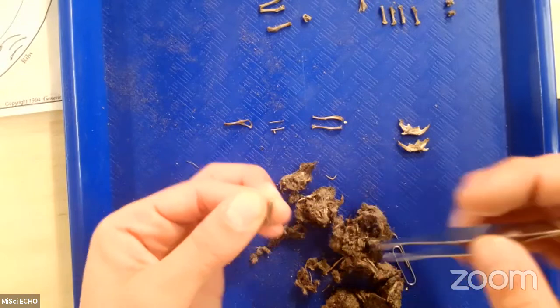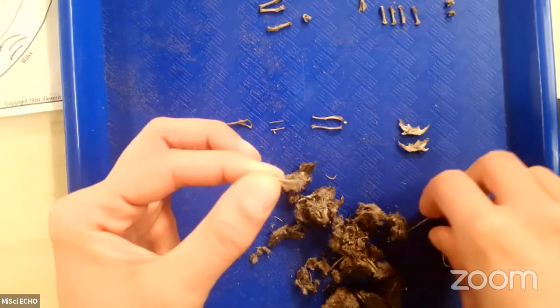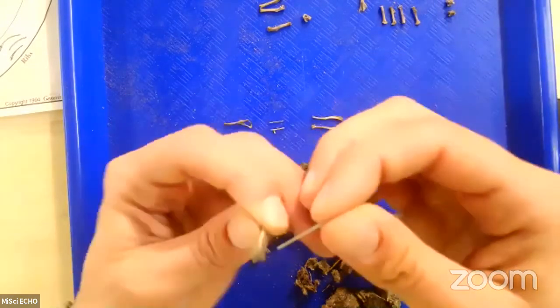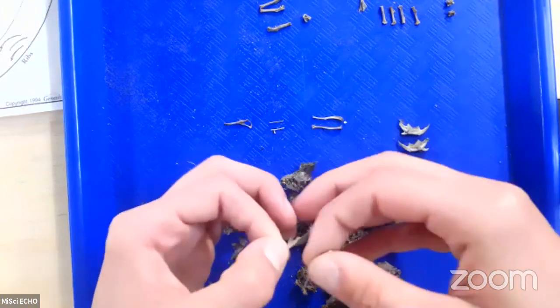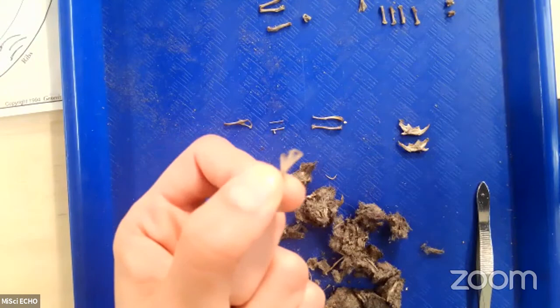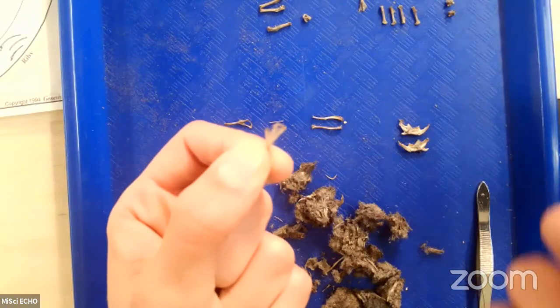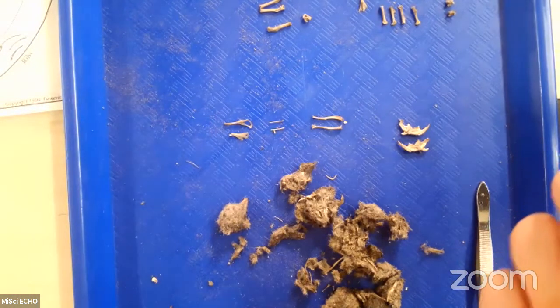Now, this is a good time to start using my paper clip here. And so you can see that just like in those archaeology pictures, we have to be very patient and very delicate. Fortunately, when we're doing an owl pellet dissection, we're not really concerned with preserving these bones. Of course, we want to be able to identify them, so it's really important that we don't break them as we go through this dissection.